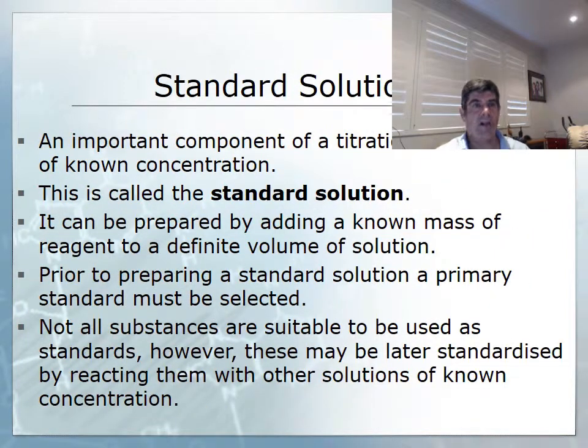Now, in order to carry out these techniques, one of the most important things we need to look at is a standard solution. I have talked to you guys about this before, but the key to a standard solution is a solution of known concentration. So let me just pop back to the blue color so it can be consistent with these videos. And so it's known. The thing with a standard solution is it must be a known concentration.